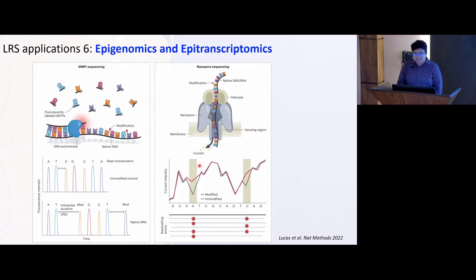Actually, I had a slide I deleted for the sake of time. Not only methylation, there's a huge list of changes that can be detected by this change of current, which is much more than what we could detect initially. Oxford Nanopore detects more because this is just current change. PacBio can also, especially 6-methyladenosine is very useful. PacBio detects it much more efficiently, but Oxford Nanopore detects a much more spectrum of these changes.